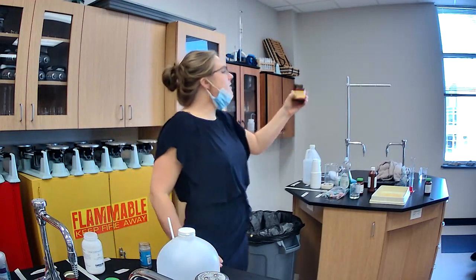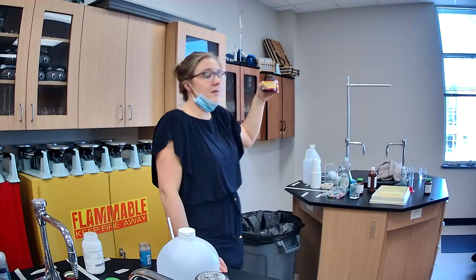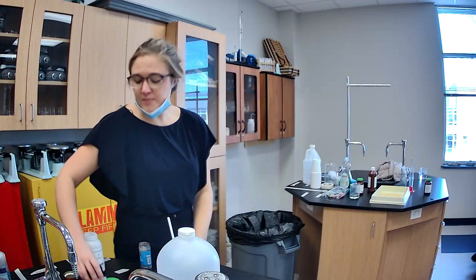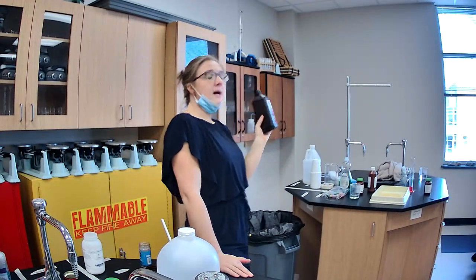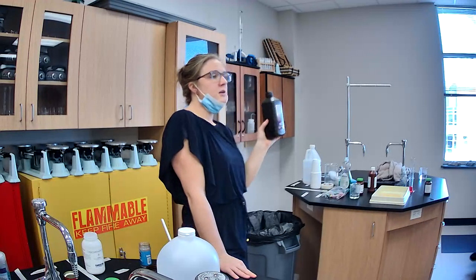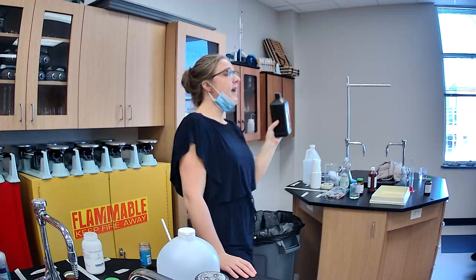It's also what you use when you bake bread. Part of the chemical reaction that bakes the bread is the yeast in there. Now instead of mixing the yeast with water, we're going to mix it with hydrogen peroxide. This is the same kind of hydrogen peroxide that you can buy at a store, what your mom might use when she cleans your cuts. This is 3% hydrogen peroxide.